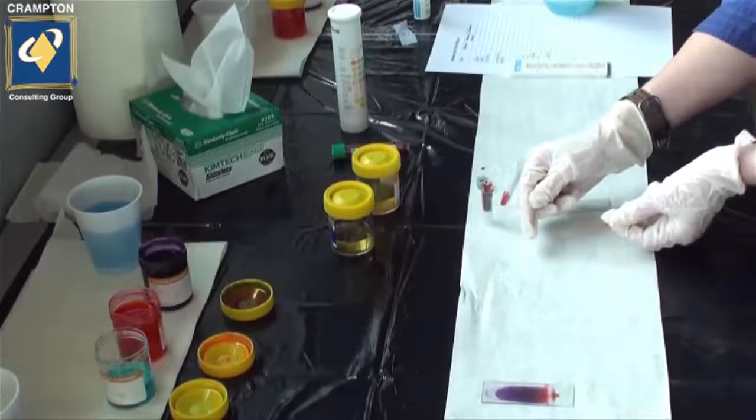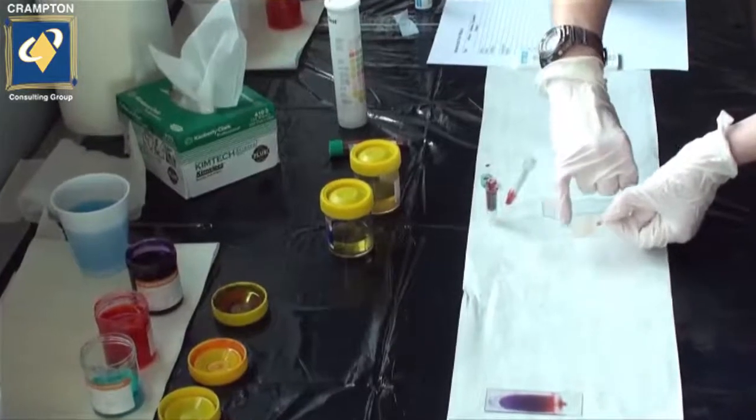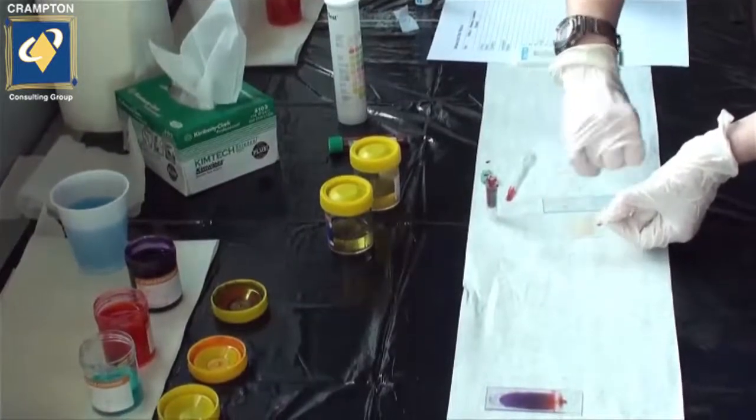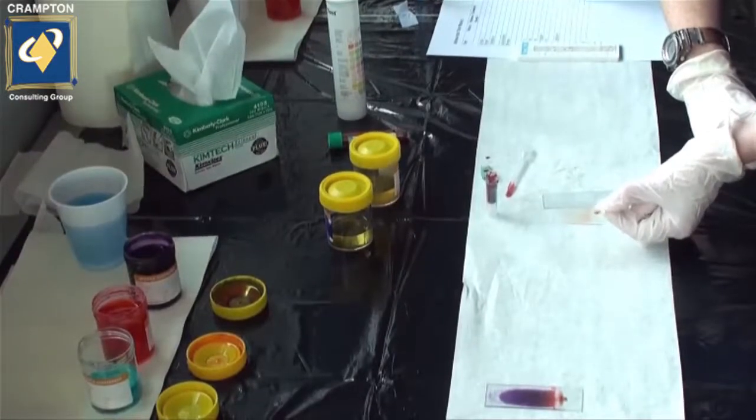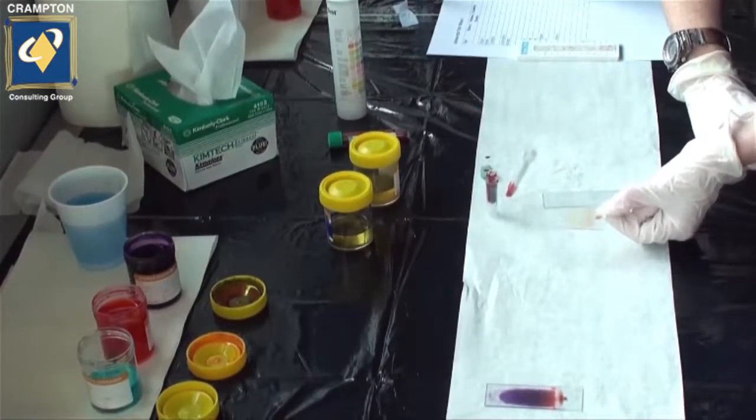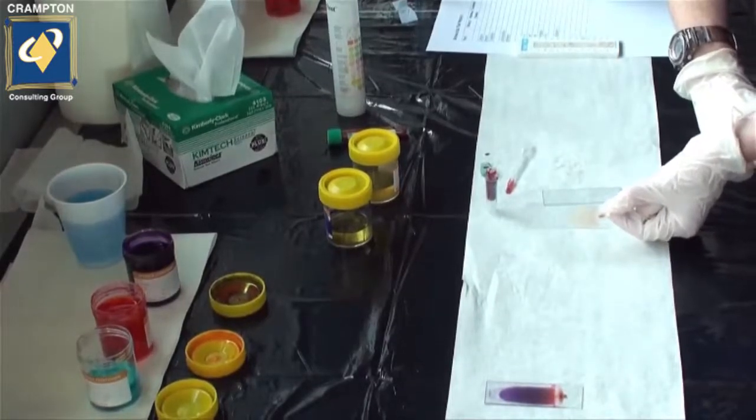The smear should be one level of red blood cells thick, and you should have adequate feathering towards the end. You shouldn't be able to see any streaks or holes. This can indicate that you're too wobbly in your technique, or you're applying too much pressure to the slide.